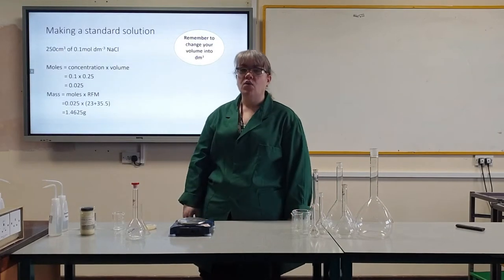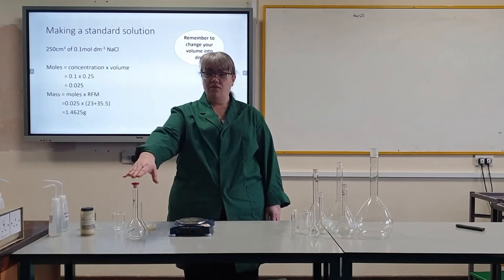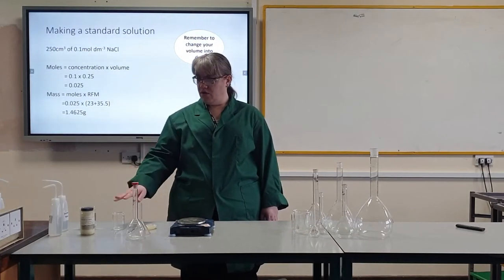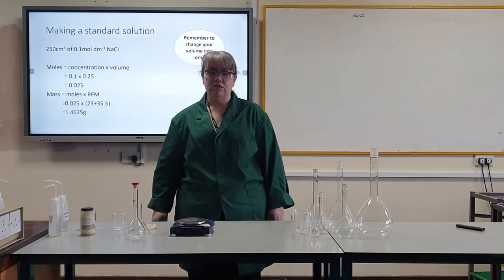I get my equipment ready: a balance, a weighing boat, a funnel, a volumetric flask, a spatula, a stirring rod, an empty beaker, my compound, and distilled water.